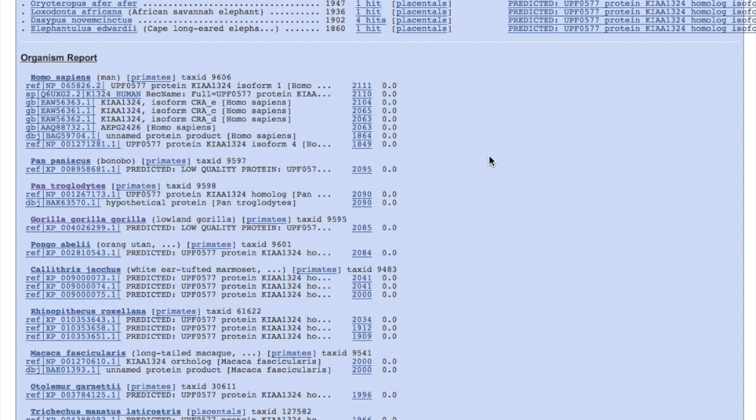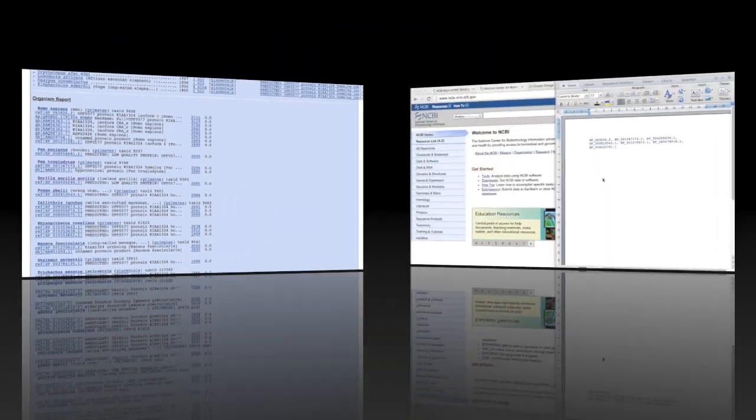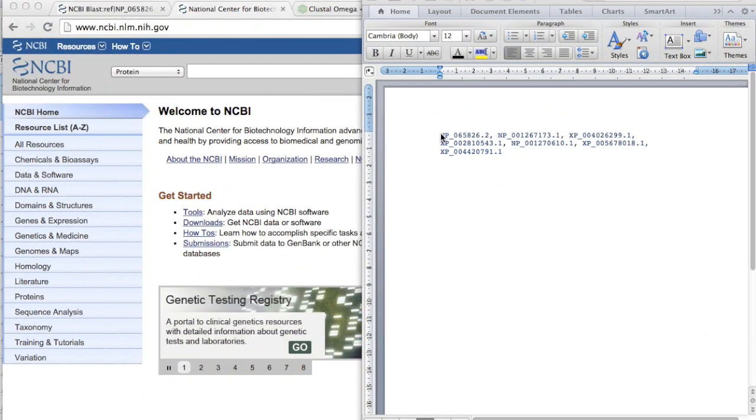And copy them into a word document. And here are the seven organisms that I randomly chose.